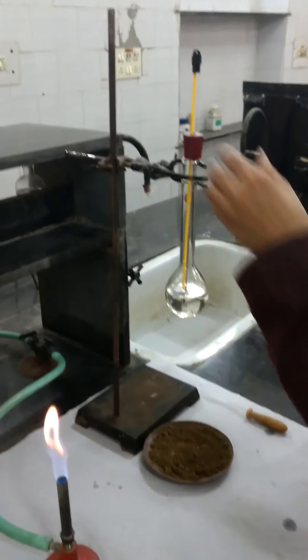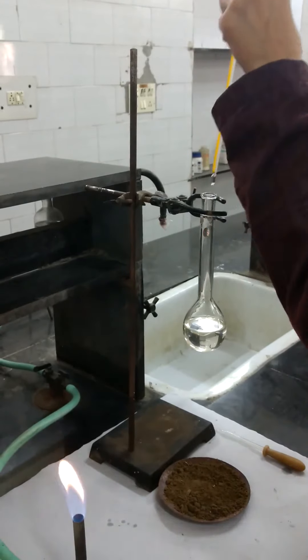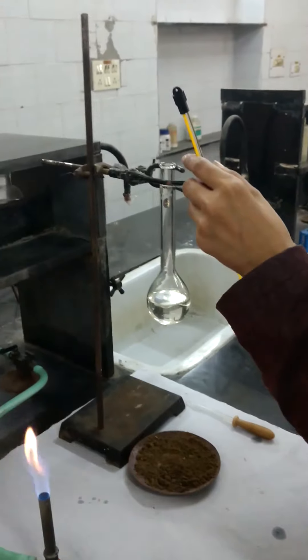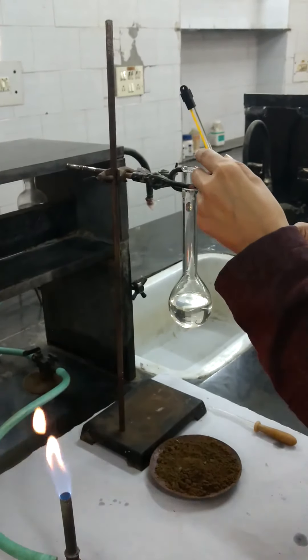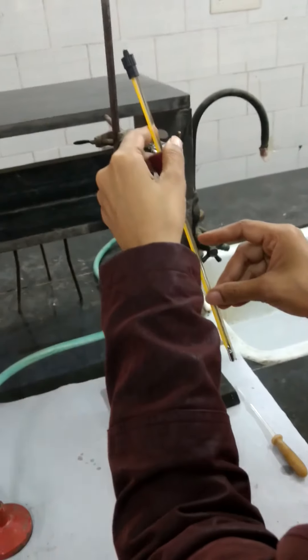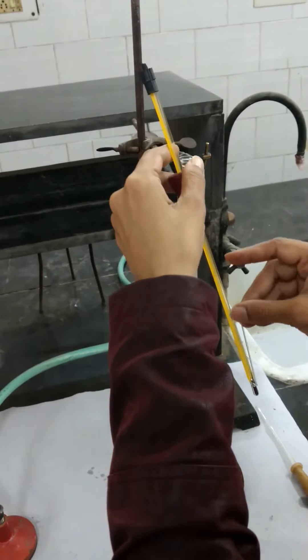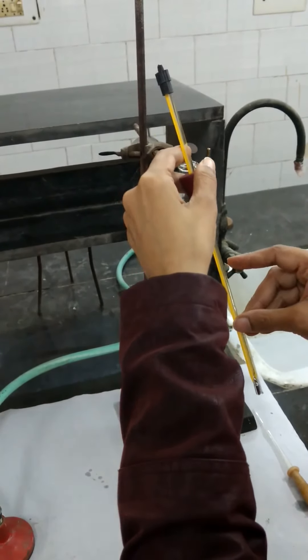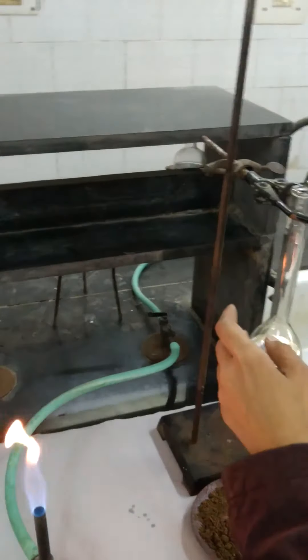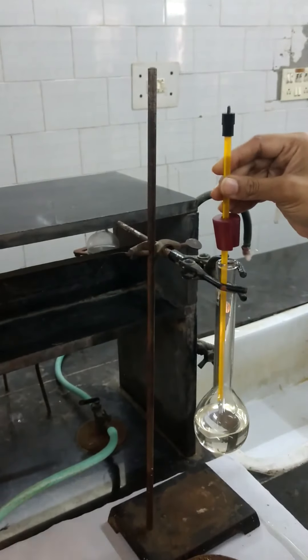Now we have this Thiele flask and a thermometer attached to it, and we have silicon oil filled in this Thiele flask, which is mixed with paraffin oil. I am getting my capillary tube sticking to this thermometer and inserting it inside the flask.